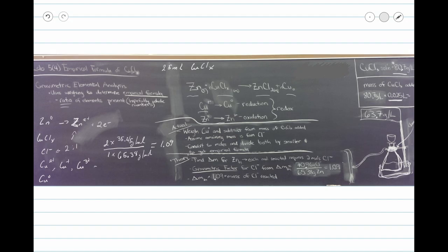Some students will like to set it up so that the base is on the other side and this is on the bench top. And that is a great way to spill your experiment everywhere. So we want to make sure that this is on the base because this will keep the entire setup from tipping over. Even if it gets a little annoying to move your clamp up and down, if it's a little hard to move, there's a little twist screw that you have to turn. It's worth it. So you don't lose your copper.